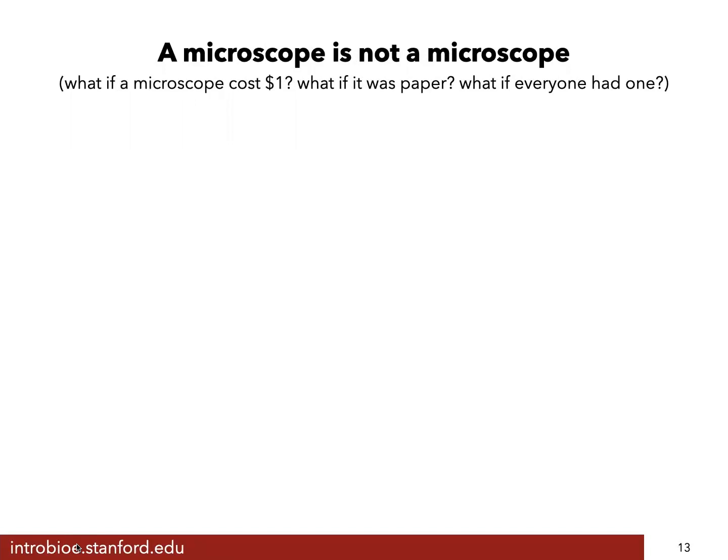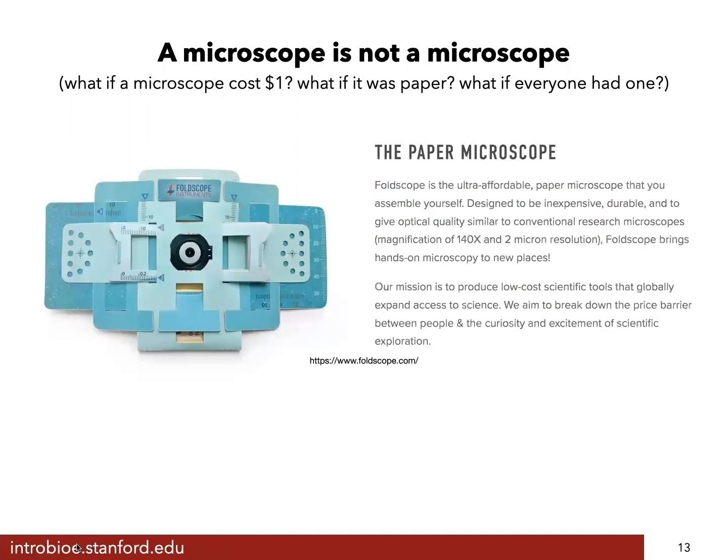A personal microscope. Well, guess what? Here it is, the fold scope. The fold scope is an origami microscope. And each of you will get one, and you'll have to build it. And then you get to use it.